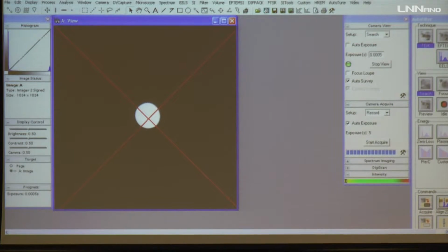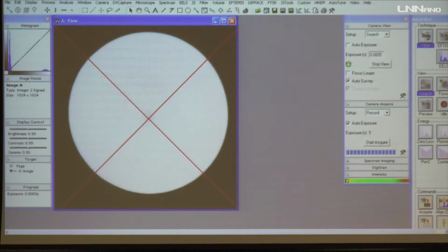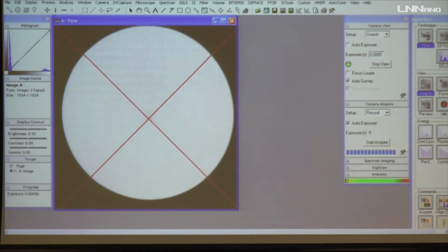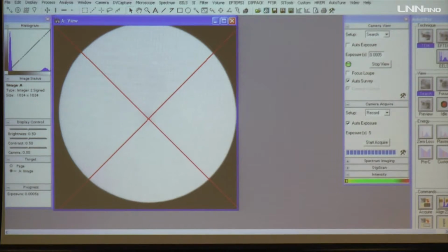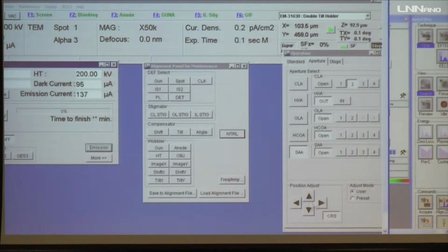So yesterday, if you remember the process, I did the same process. I focused the beam and centered it to the optic axis, and I opened the beam and checked if it's opening concentrically about the optic axis. And I believe it's very good, but still I can make some modifications. For doing that, I use this panel, that's position.